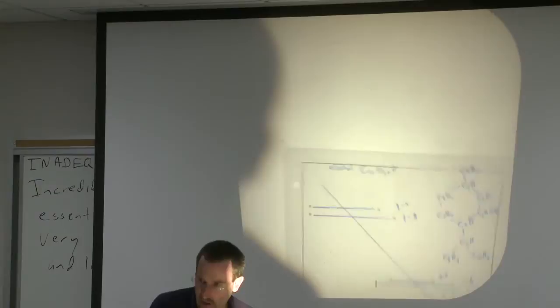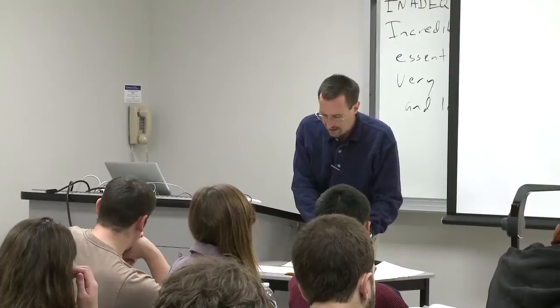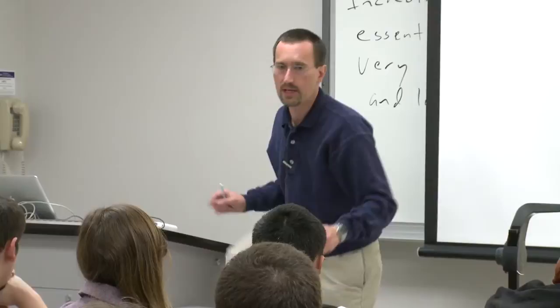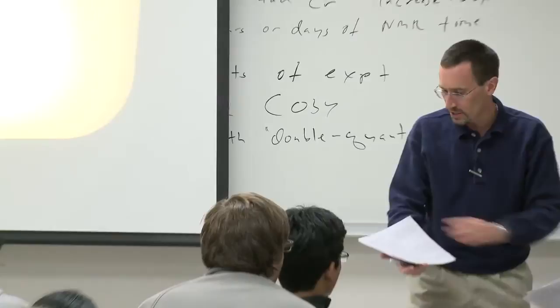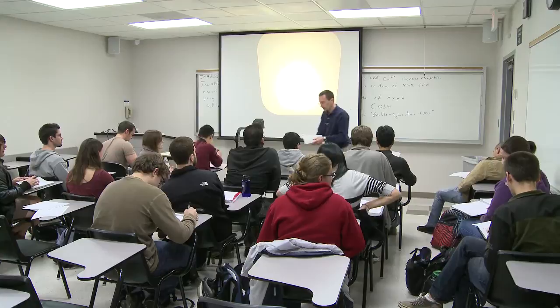And as I said, very, very powerful. Very tempting and teasing because, of course, it is so powerful, and yet very frustrating because it isn't something that you can pull out except in heroic circumstances. So this is the handout from Nakanishi's book on the technique. What I like about his book is he always has just a short little paragraph on the technique and then an example here. This particular molecule happens to be the monoterpene menthol.